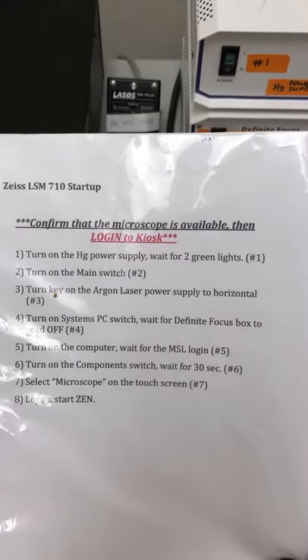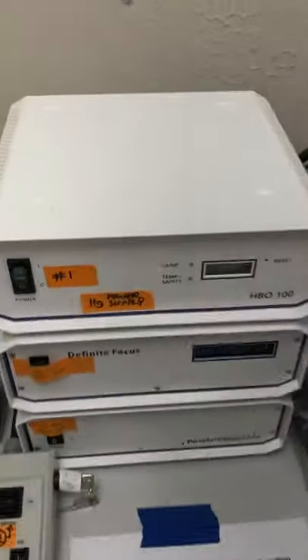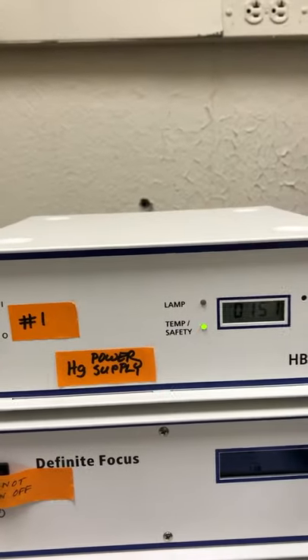The first thing we're going to do is turn on the mercury power supply and wait for the two green lights — that's item number one. You can see here: mercury power supply, number one, turn this on, and then these are the two lights that we're going to wait until both are on before we continue.